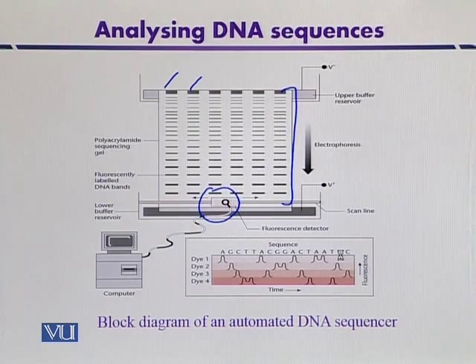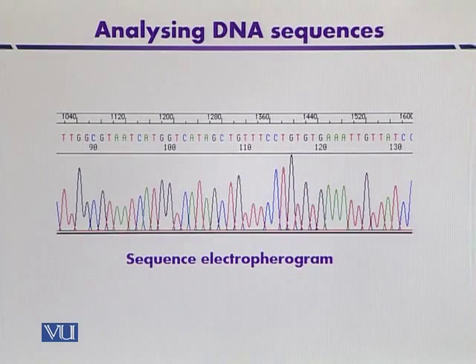So here different samples are run in their respective lanes, so more samples for sequencing can be analyzed, and each will be represented by different colors. I think you will better understand in the next diagram that each base has its own fluorophore.